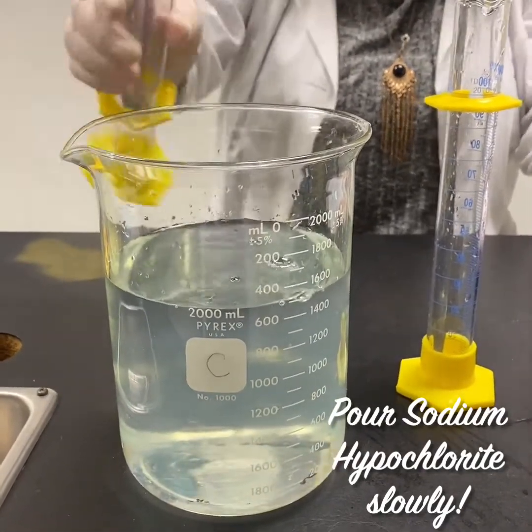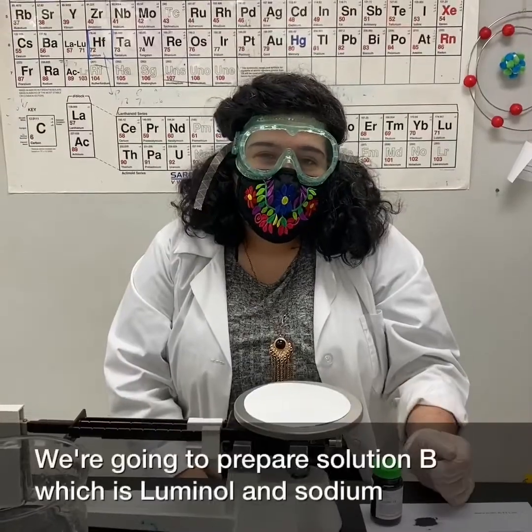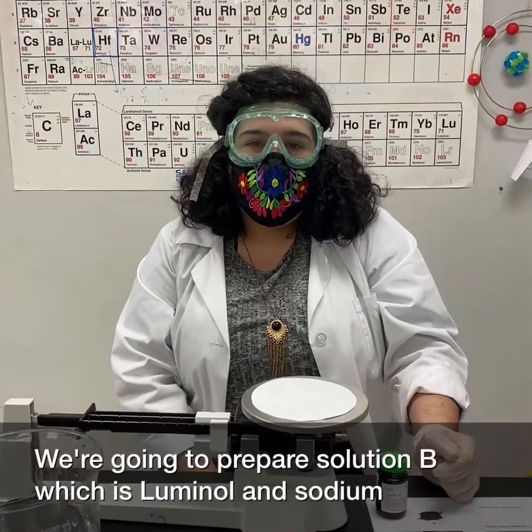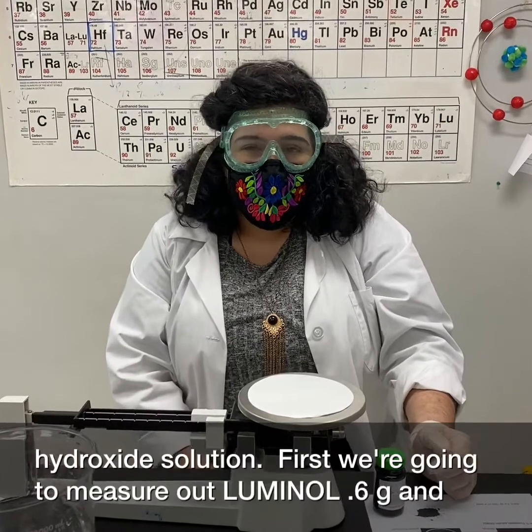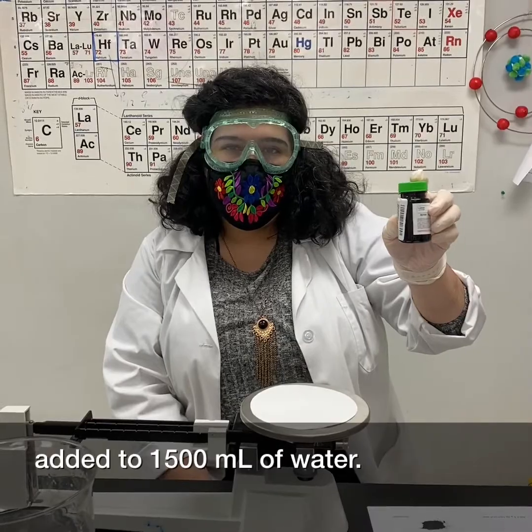Next, we're going to prep Solution B, which is a luminol and sodium hydroxide solution. First, we're going to measure out luminol — 0.6 grams — and add it to 1500 milliliters of water.